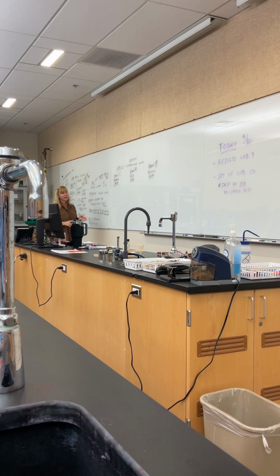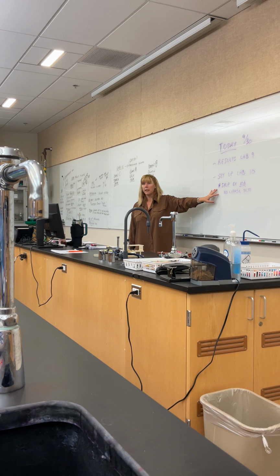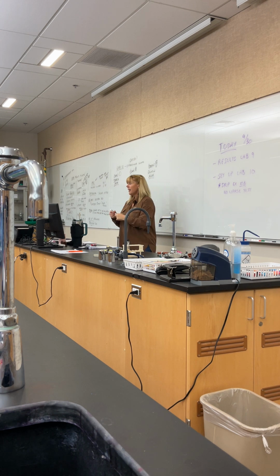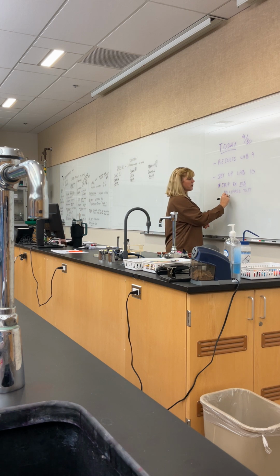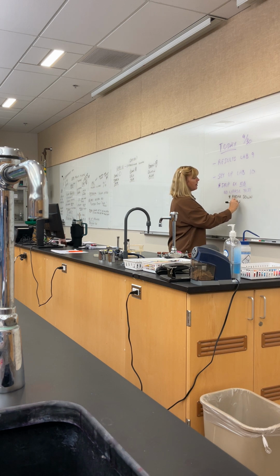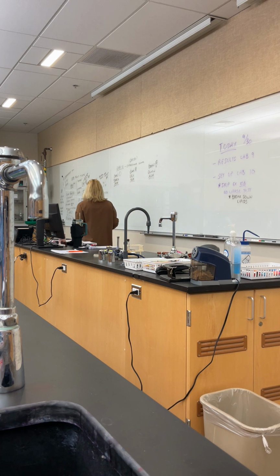So we're going to be setting up 3 different types of media today to look for extracellular enzymes to see if our organisms have them. Now we are skipping exercise 10B. We were not able to get any lipase media. But what kind of molecule do you think lipase would be breaking down? Lipids, yeah. So I do still want you to know that lipase would break down lipids. We're not going to be able to see it, and that's okay. They were back-ordered on the media. But just know lipase means it can break down lipids.